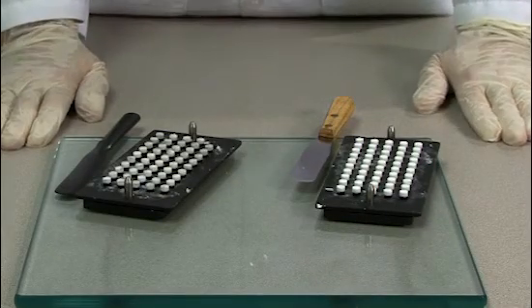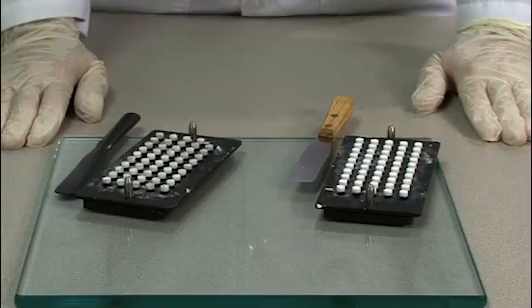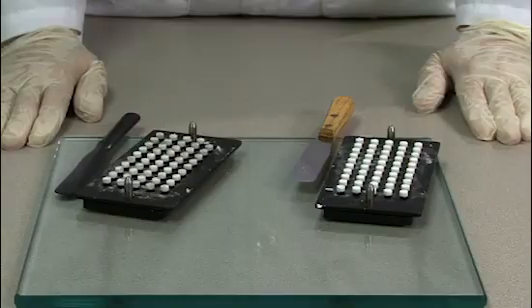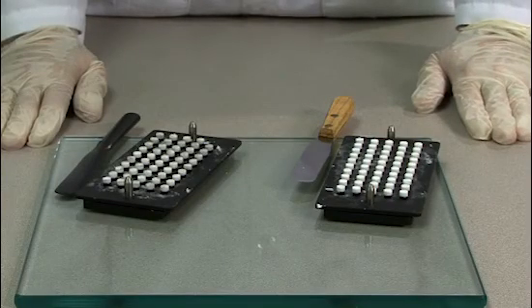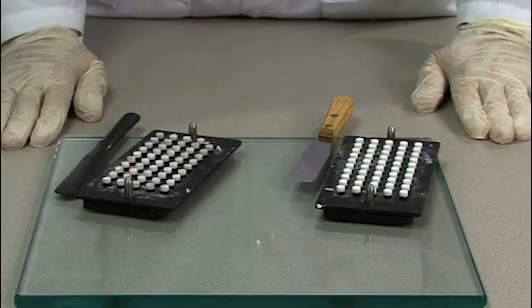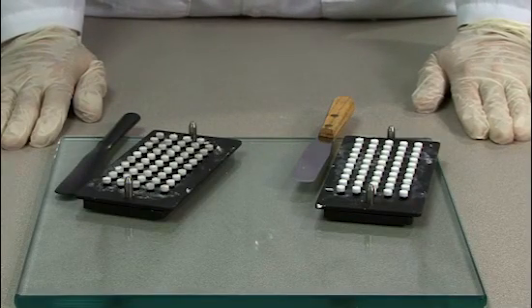It's also of historical note that in older literature, it was suggested that you use a whalebone spatula to make tablet triturates. And I have to wonder if they knew something about the hard rubber spatula even back then.